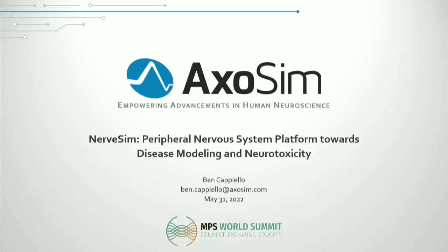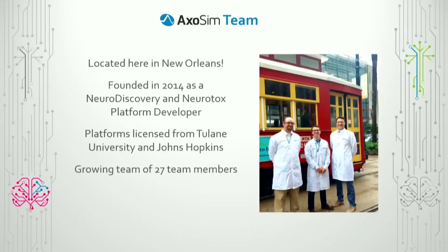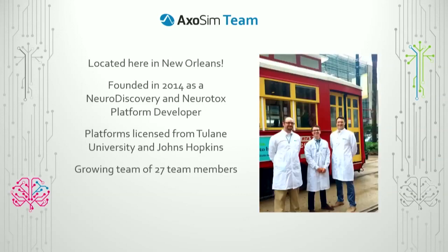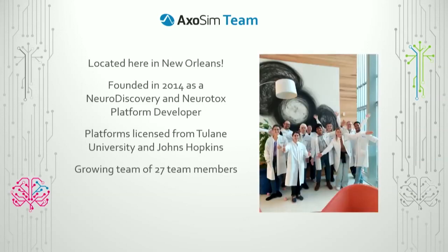So my talk is going to concentrate on our NerveSim platform at AxoSim. Stefan mentioned the CNS models, but I'm going to talk about the peripheral nervous system. Briefly, we're located here in New Orleans. We have a bunch of our team members here, which is fun. We were originally spun out of Tulane University as a platform developer, both in neurodiscovery and neurotoxicology.